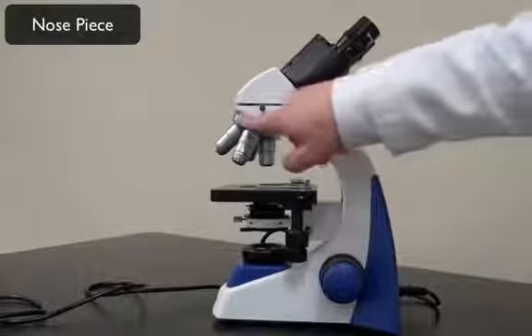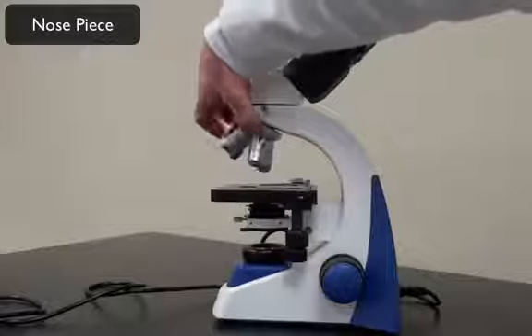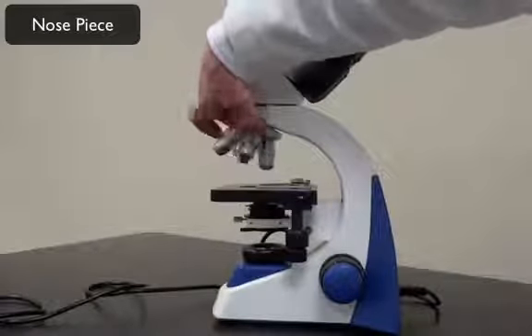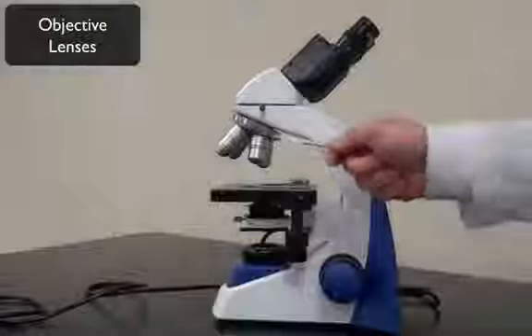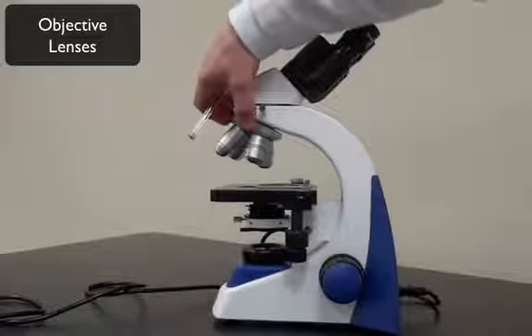Now you'll notice here the nose piece of the objective lenses. This allows for the movement of our 4 objective lenses here. Okay, and you can hear that they lock into place. Our lowest power objective lens is commonly referred to as scanning power. Some references use low and scanning power as the same, but we'll say this is our scanning power. It's 4 times the magnification. And that's how we always start off viewing our slides. We'll talk about that in part 2.